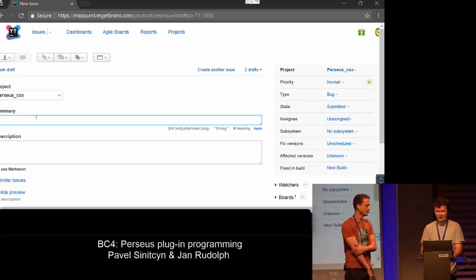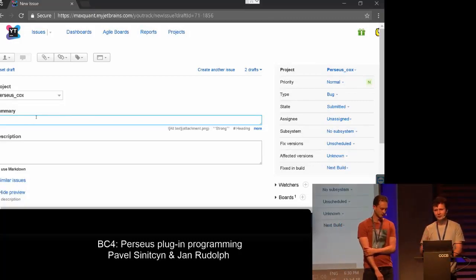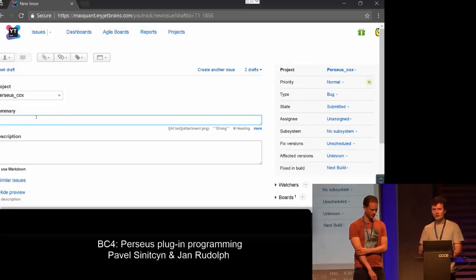Basically, we are working on it. For any bug that appears, all of us receive an email, and we really try to solve it as fast as possible. So how are we naming this bug?